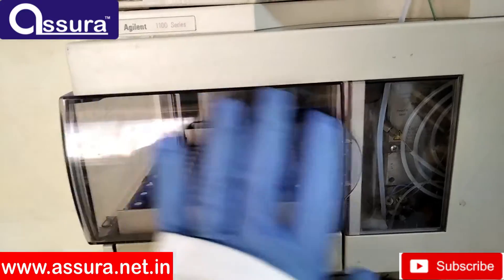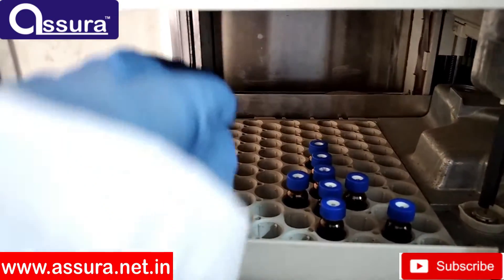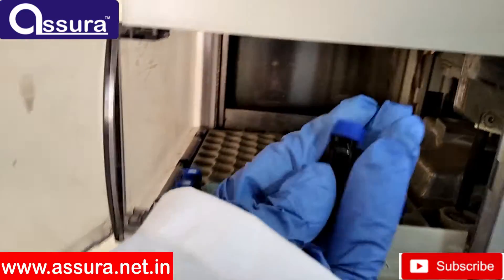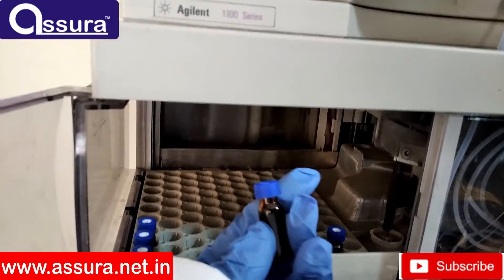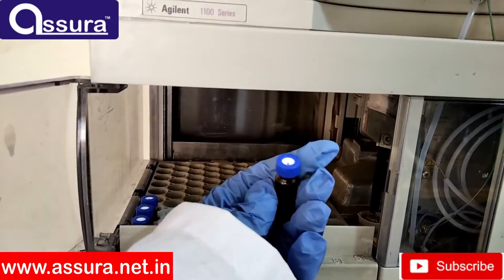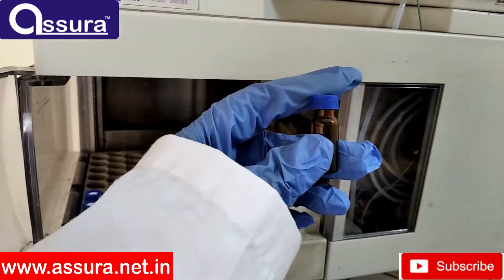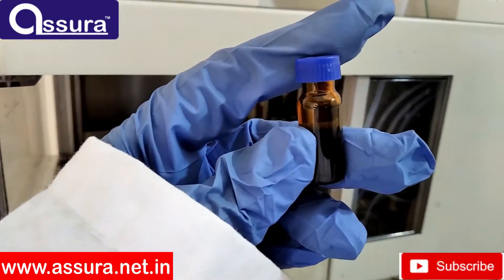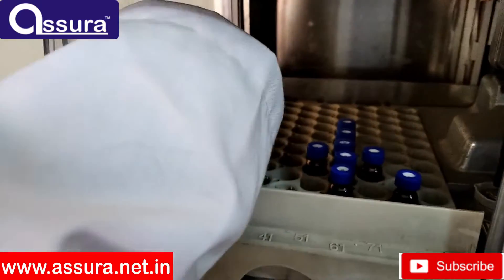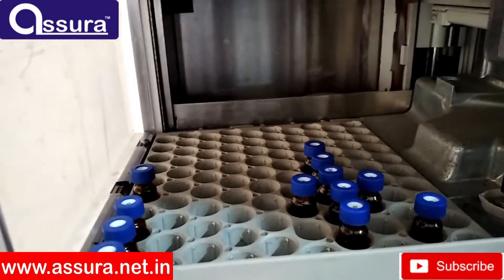Now the vials. These are the HPLC vials which have a capacity of 2 mL. These vials are transparent and in amber color for light-sensitive samples. These vials have a blue color cap with a septum to close the vial. Sample solution is filled up to the 1-point alignment of the vial to avoid bubble formation. Many companies use this vial for one-time analysis to avoid contamination, but it can be reused after washing.